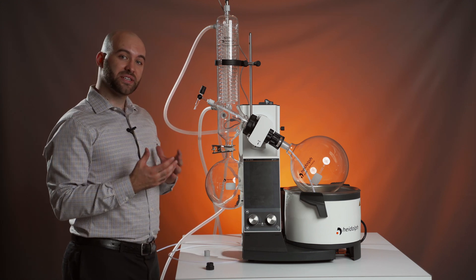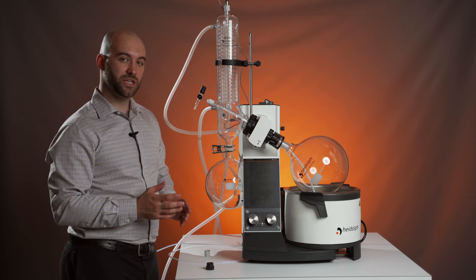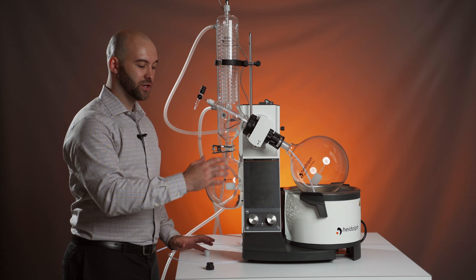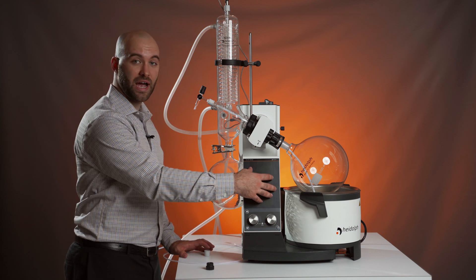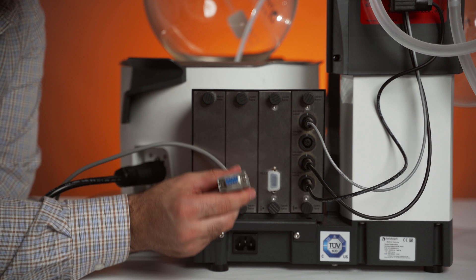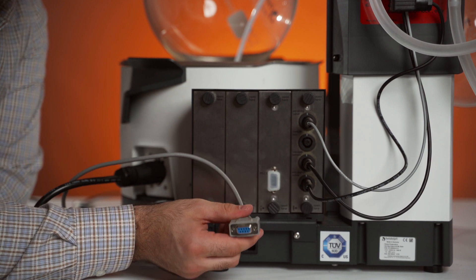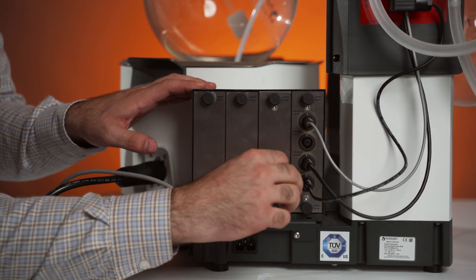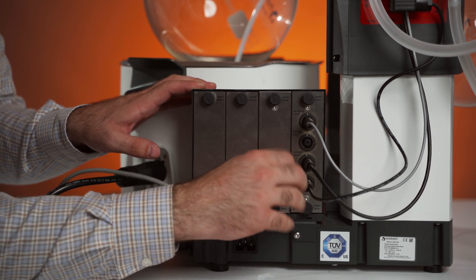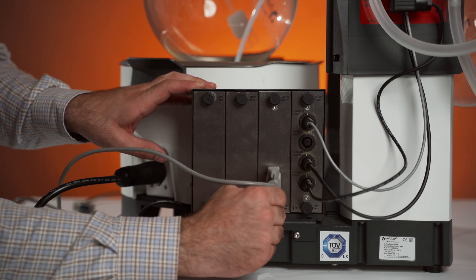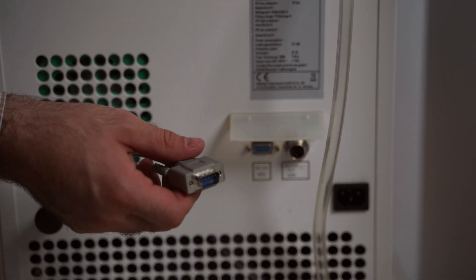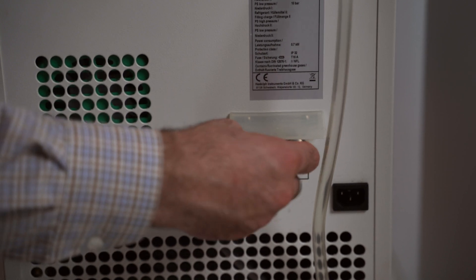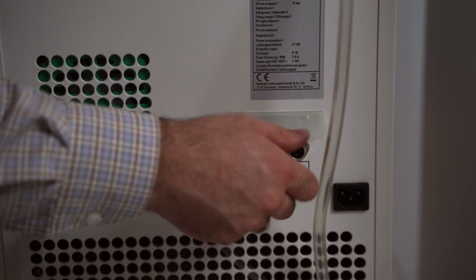The third accessory that is commonly used with the rotary evaporators is an RS-232 cable that will connect your HiVap to your chiller so you can operate your chiller's cooling parameters from your HiVap ultimate panel. First, we're going to connect our RS-232 cable to the control box right here and clamp it down with the screws. The other end of your RS-232 cable will connect to the back of the chiller right here and screw in as well.